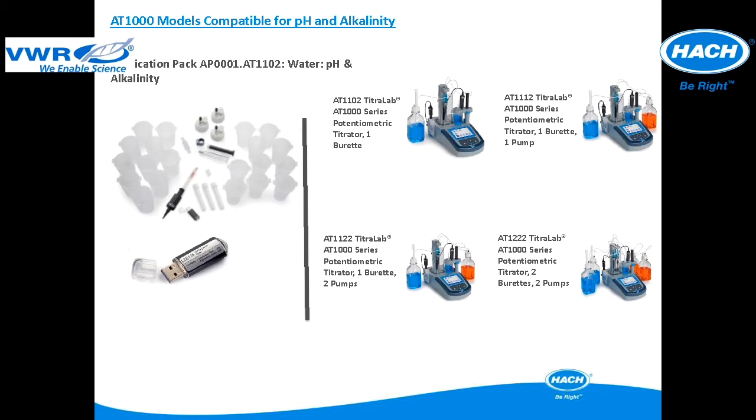The application package AP0001.AT1102 is used for pH and alkalinity in water applications. The application package is compatible with all the AT1000 titrator models, including the AT1102, AT1112, AT1122, and AT1222.